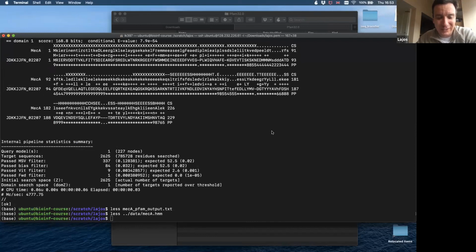I hope you all see that it's so easy, and it's of course way much faster if you have hundreds or thousands of sequences. So if you just think about the HMM search, you can put more than one HMM here, so you can put the whole Pfam database, or you can put your selection of domains you are looking for, and you can put as many FASTA entries here.